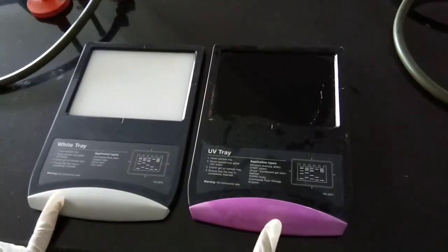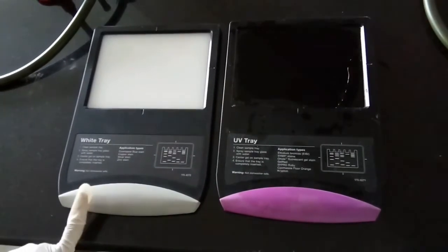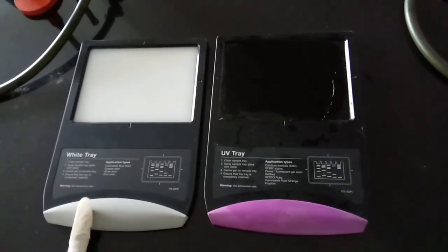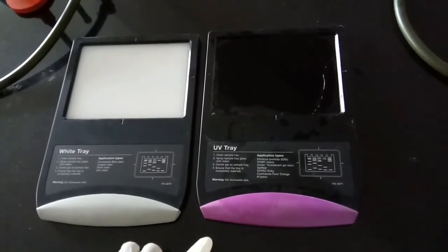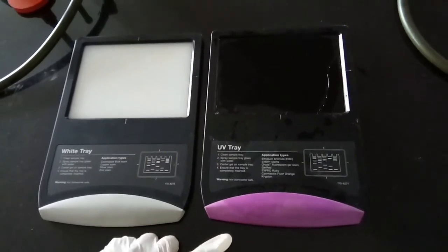The UV tray is used for documentation of nucleic acids by agarose gel electrophoresis, and the white tray is used for documentation of proteins by using SDS-PAGE or native PAGE. There are two more trays, the blue tray and the stain free tray, which are also used in the gel documentation system.